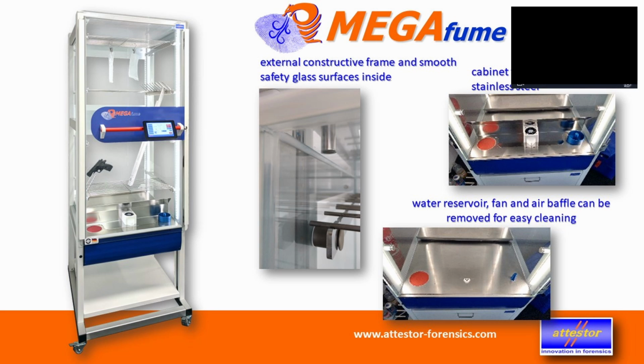On the right side, on the upper picture, you see this kind of blue thing. There will be a picture where you see it much better. That's the water reservoir for the humidifier. And most of the accreditation documents do actually say you have to replace the water after every run. Why is that the case?